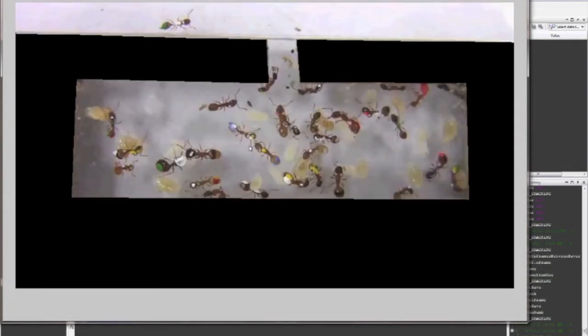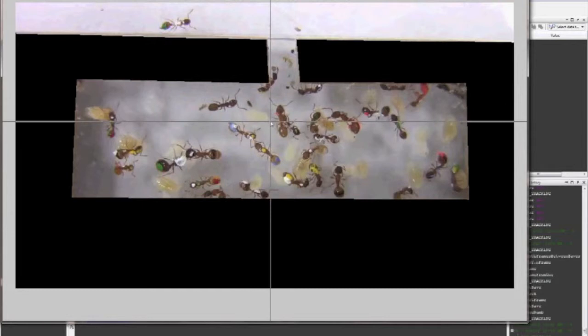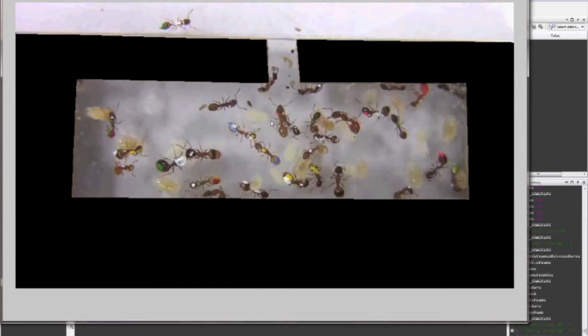Part of the frame will be blacked out. The blacked-out area should be the part of the frame where no ants will ever go. If the wrong part of the frame is blacked out, right-click to invert the frame. If you've made a mistake, left-click in the black area to start this process over. If you're ready to move on, left-click in the colored area to go to the next step.